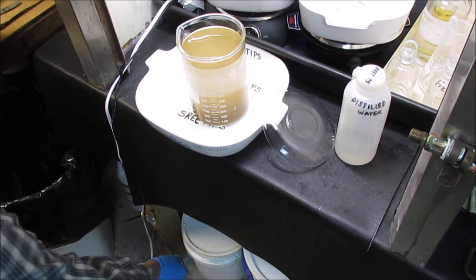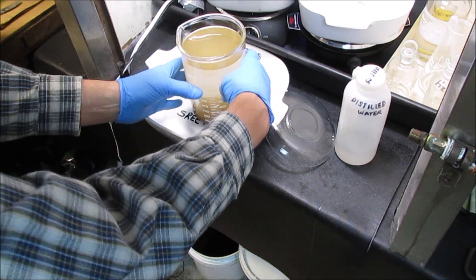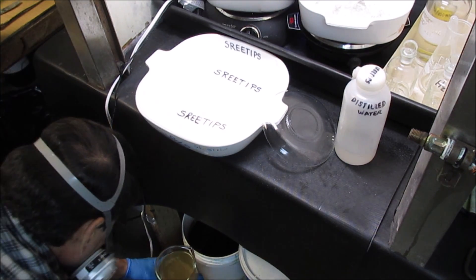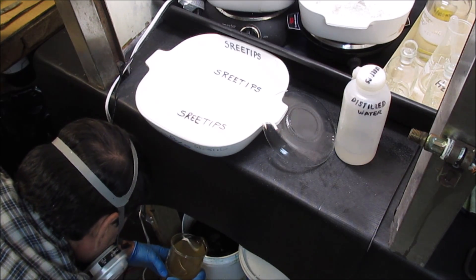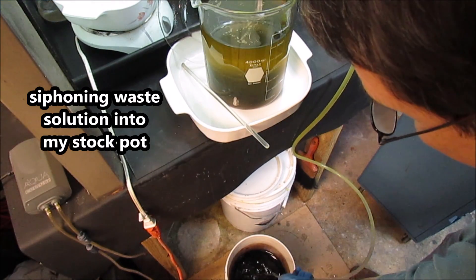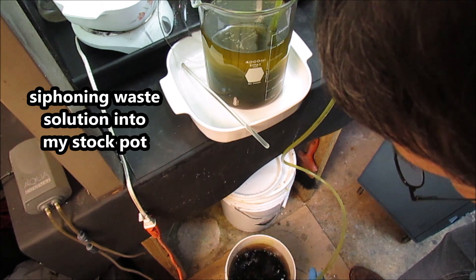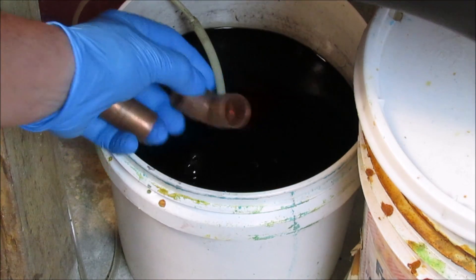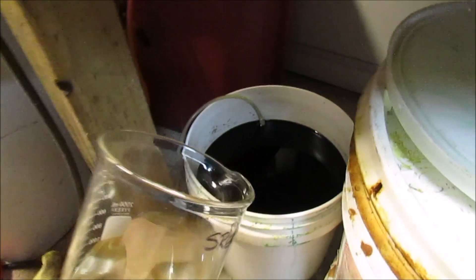What is a stock pot? My stock pot is a container that receives every drop of my gold refining waste solutions after the gold has been removed. These waste solutions often contain platinum and palladium in trace amounts that are too small to try to refine. My stock pot is kept full of copper so that the traces of platinum group metals can cement out onto the copper and accumulate as a black mud that settles to the bottom of the container.